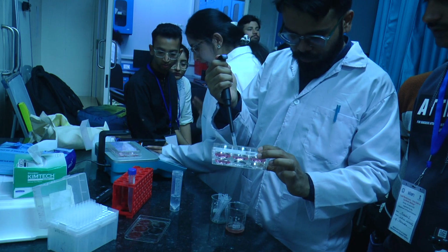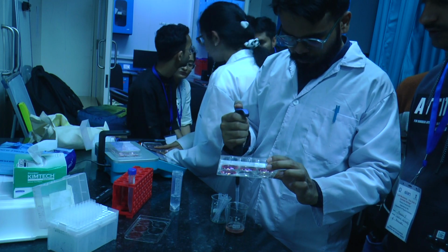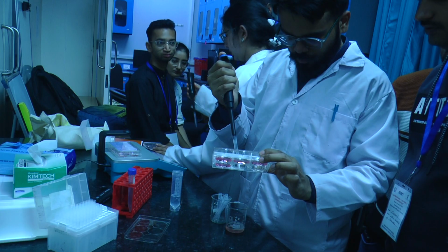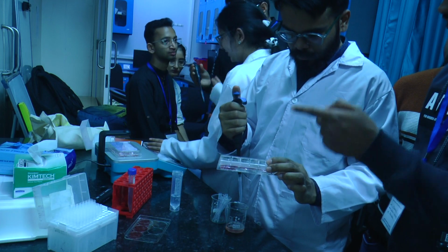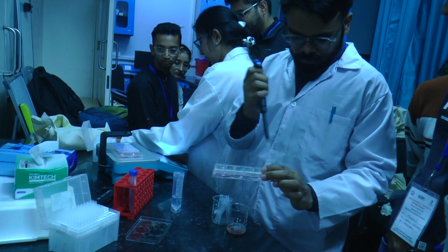You have another step, right? Only 2 cards. That micro tip another 500 microliters. So you discard this, right?